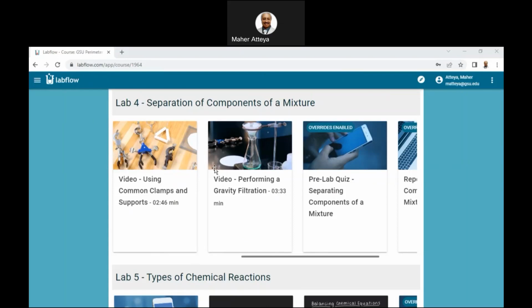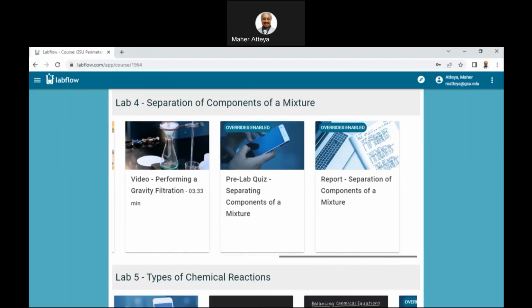This is not really a lab report per se, but this just tells you where to find the stuff and what is really important. So we have this one here, and we will go to the last one, which is very important. The last one is this one here. Take new, then I am pasting it into this.